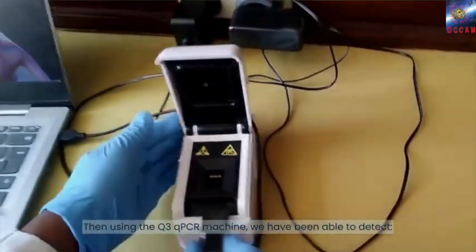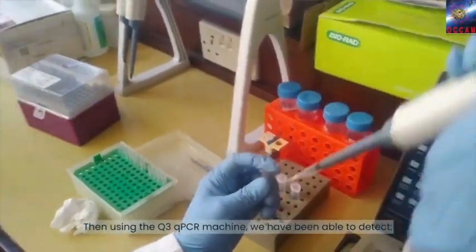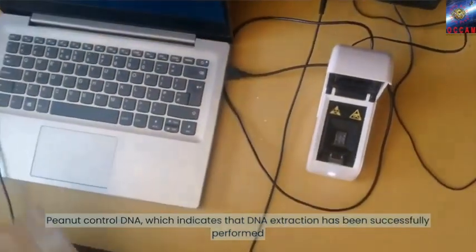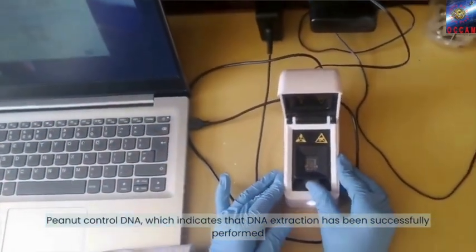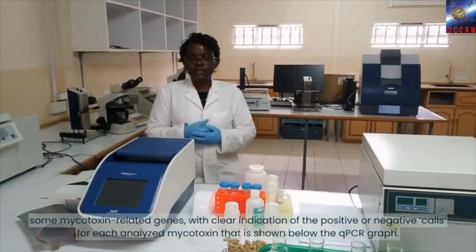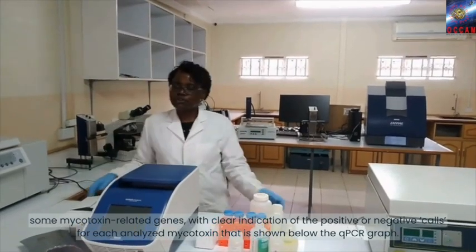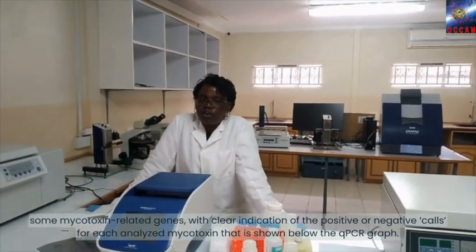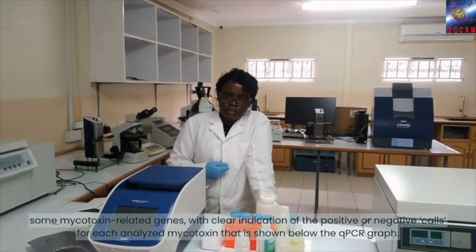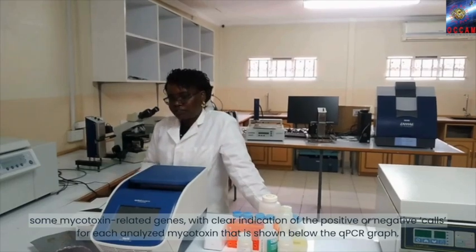Then, using the Q3 qPCR machine, we have been able to detect peanut control DNA, which indicates that DNA extraction has been successfully performed. Some mycotoxin-related genes were also tested, with clear indication of the positive or negative calls for each analyzed mycotoxin, and these are always shown below the qPCR graph.